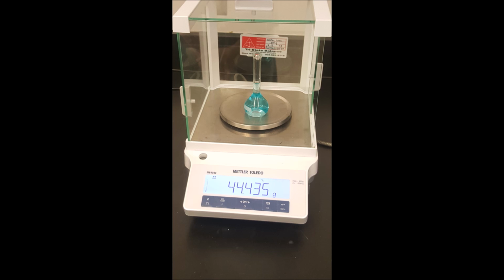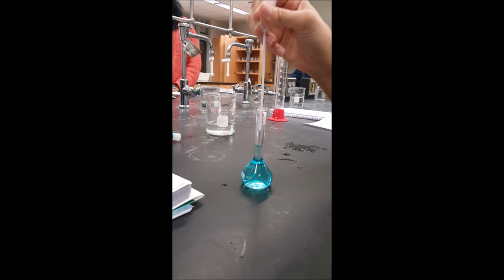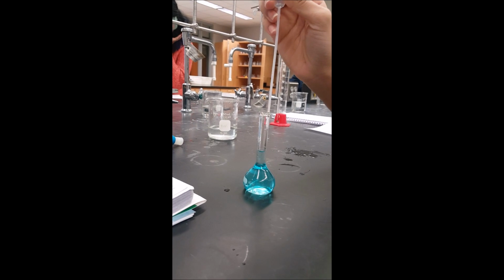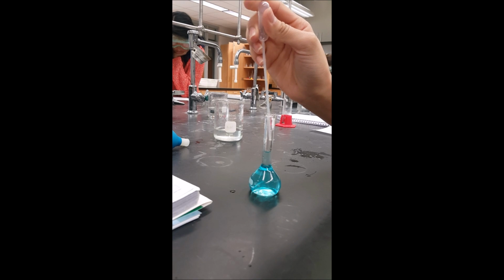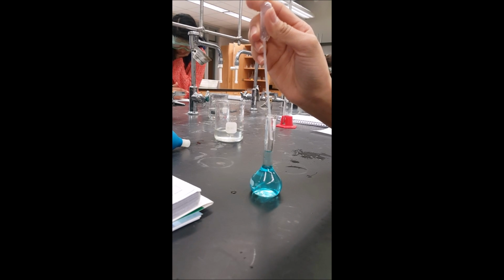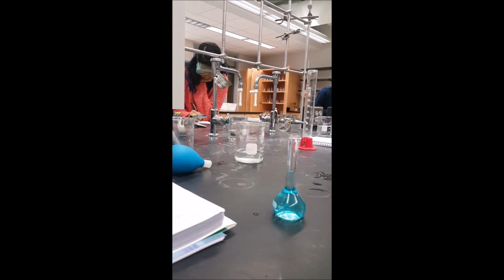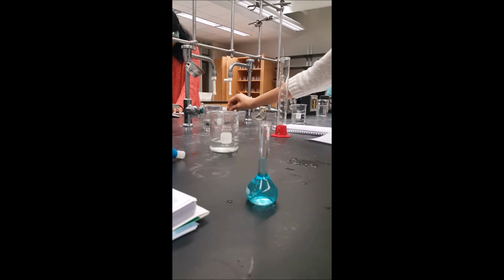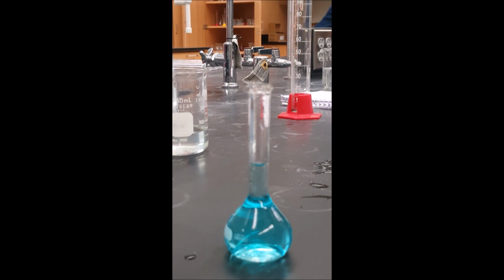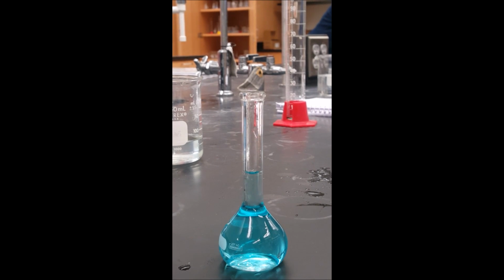Once you've done this, you're ready to do your conversion in the equation C1V1 equals C2V2. C1 is your stock solution concentration. V1 is the volume of stock, which you get from subtracting the amount left from the initial amount of stock solution when transferring into the volumetric flask. And then to find C2, you know that V2 is 25 milliliters because that's how much is in the volumetric flask after you've diluted your concentration.